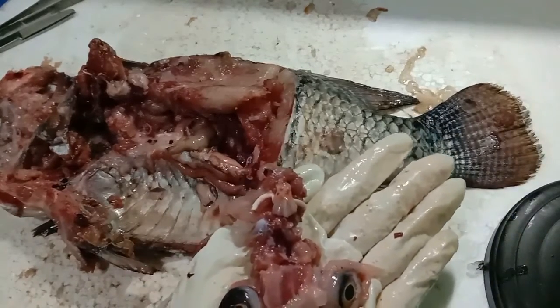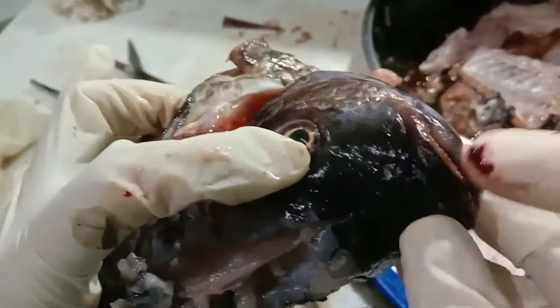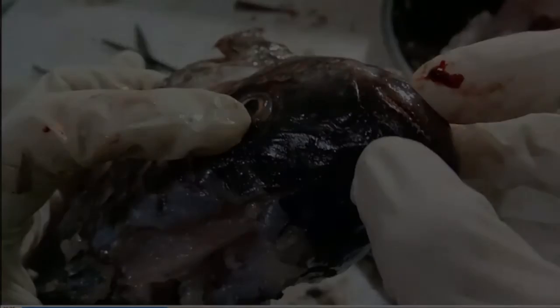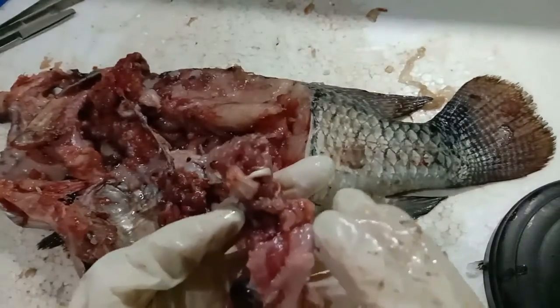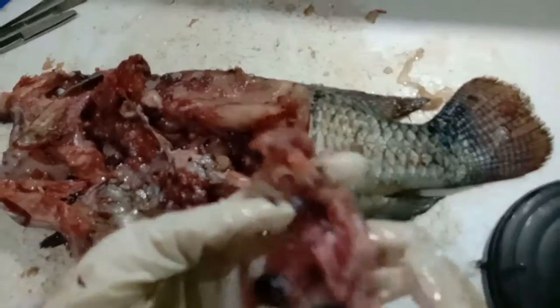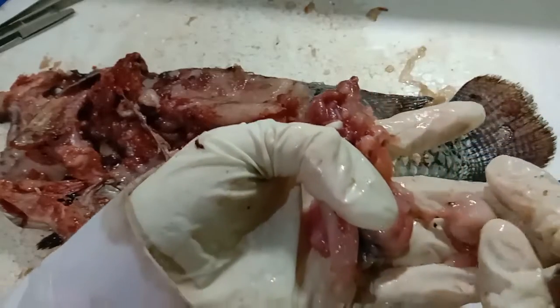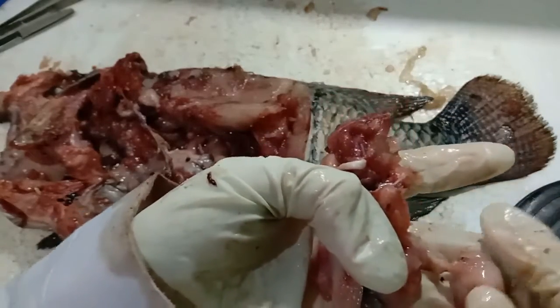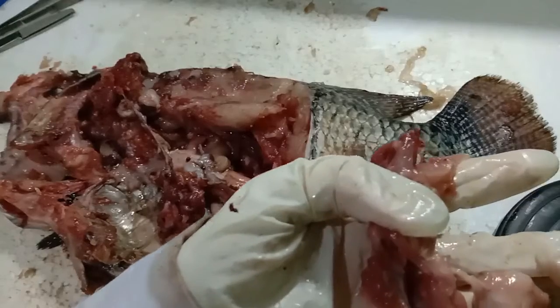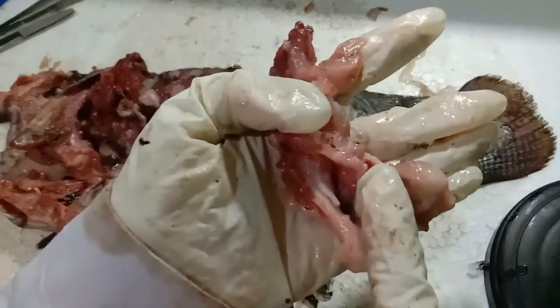Olfactory nerves are attached from the cerebrum to the nostril. There is the nostril. So under the nostril there are olfactory nerves, the primary processing of odor information. Also, the optic nerve is responsible for the light reflex and the accommodation reflex, and also the perception of brightness. Color perception and contrast are all possible because of this optic nerve.